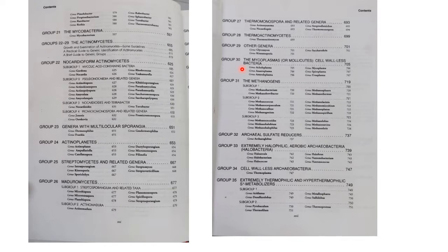Okay, so we are towards the third category. Then the fourth is archaeobacteria, that is methanogens, archaeal sulfate reducers, extreme halophiles, aerobic halophilic archaeobacteria, then cell wall-less archaeobacteria, and extremely thermophilic, hyperthermophilic metabolizers.